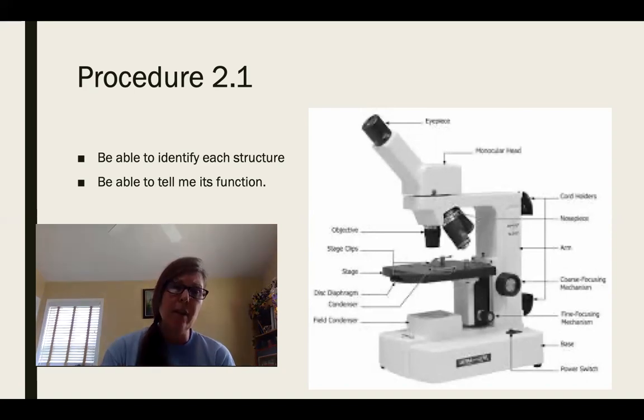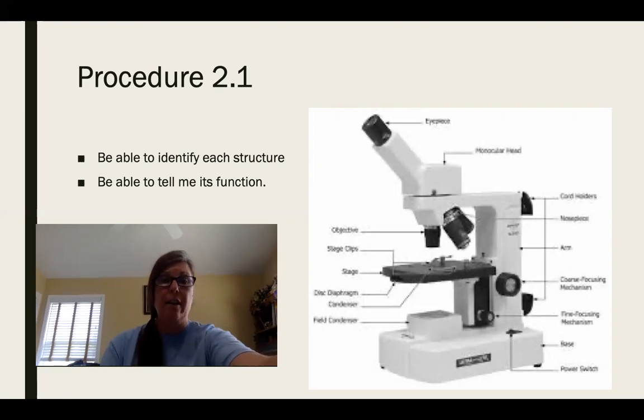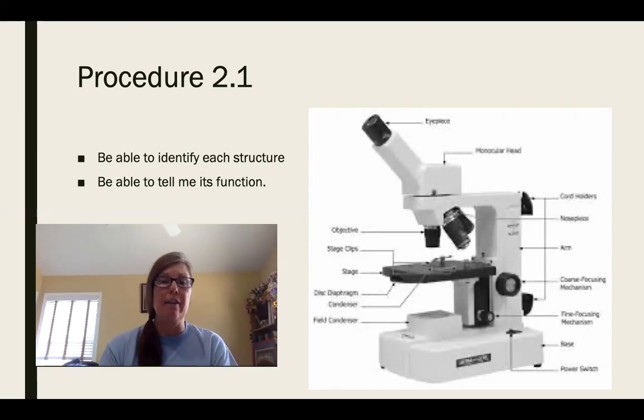The biggest problem I found with the virtual microscope, specifically the first link I have that uses the Adobe Flash Player, is that, notice in the picture here, the objective is in the front of the revolving nose piece. In your program, it's actually in the back. I was getting really frustrated because I could not find my letter E until finally I realized that it's reversed. So make sure that the 4x objective, which is your scanning lens, is to the back on that particular microscope, or else you are not going to see anything and you'll be sitting there forever getting frustrated.